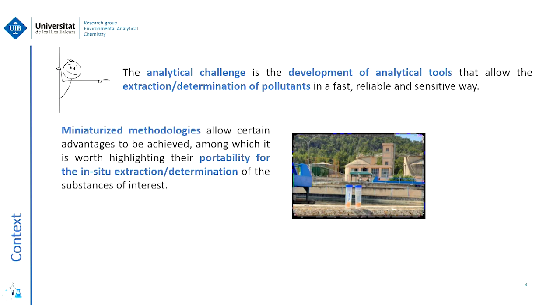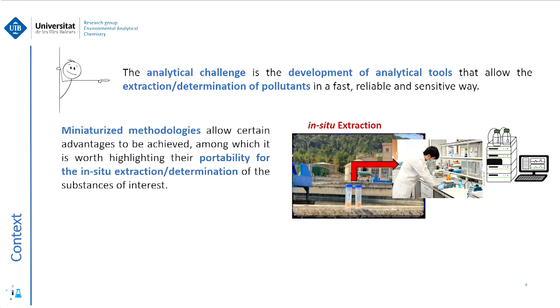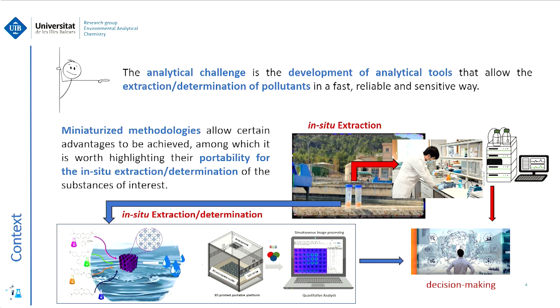In this way, we have two possibilities. The first one is to make the extraction in situ and then the analysis in the laboratory. The other one is to make the extraction in situ as well, but the analysis in situ in the field, which allows a decision to be made in the moment.